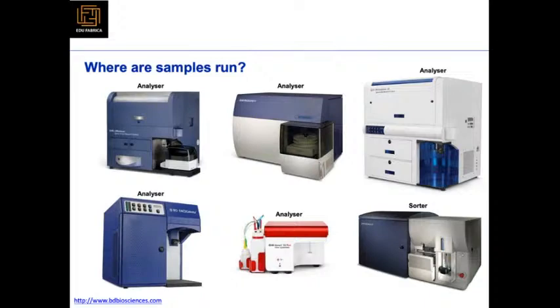Then these are the various samples that are being run. These are the various analyzers. Most of them are from BD Biosciences, BD FACS, and various companies whose names are there. You can check them out.